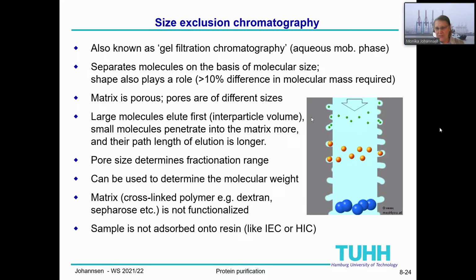The stationary phase in size exclusion chromatography is a porous matrix. The pores are of different sizes, and these sizes will determine the fractionation range a matrix is offering.